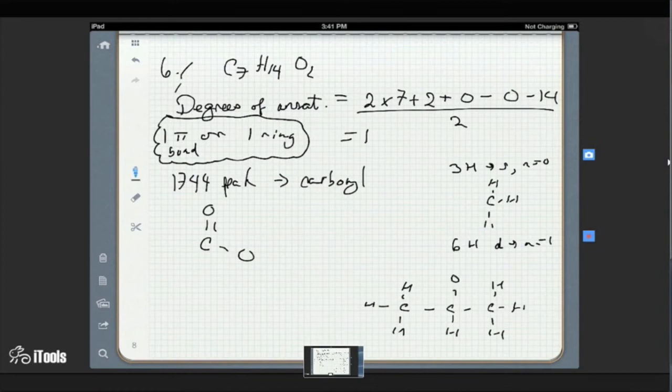Okay, so if this was an ester, you drew the O there. Carbon, double bond, O. And then there's an alkane stretch. So that's fine. Or maybe this is our methyl group, the one on the other side of the ester, that could be the 3H peak at 2 ppm.